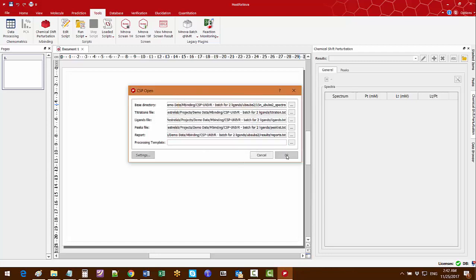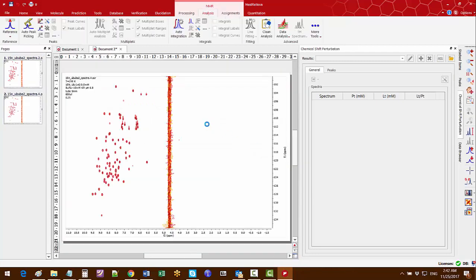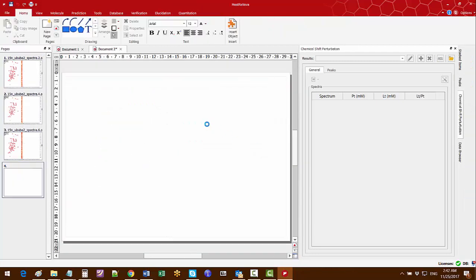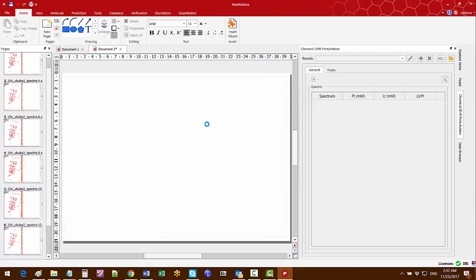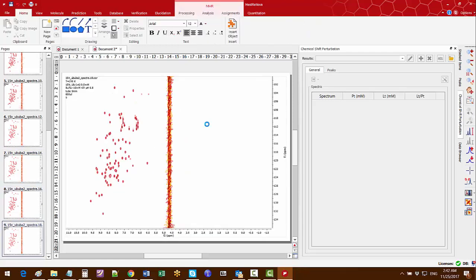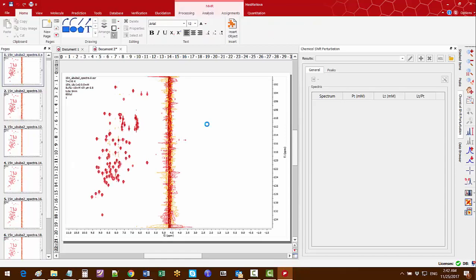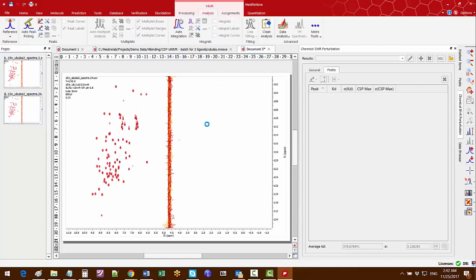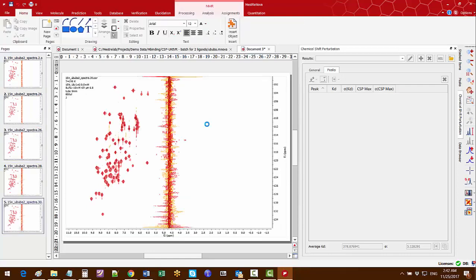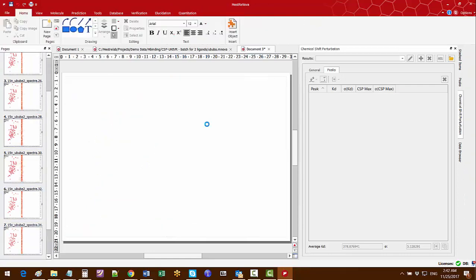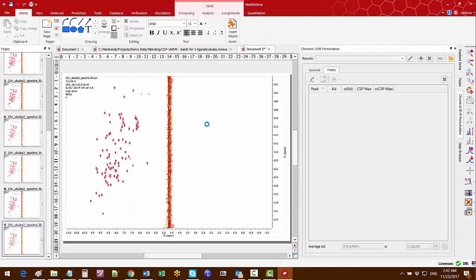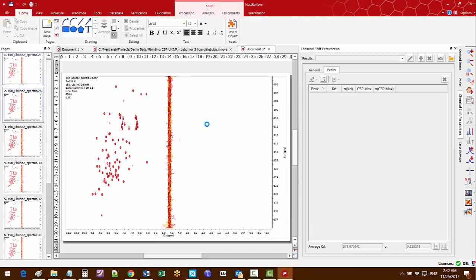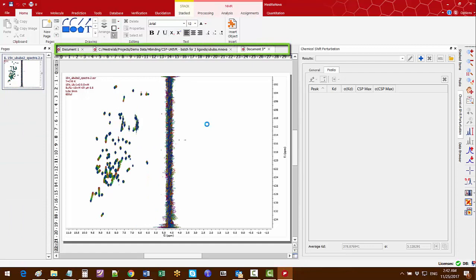Now I click OK and Mnova will go through all ligands and for each ligand it will import each SER file and do automatic processing — stacking them, importing the peaks, following their chemical shift changes and computing the KDs for each of the peaks, calculating also the average KD and generating a Mnova document containing all the results.